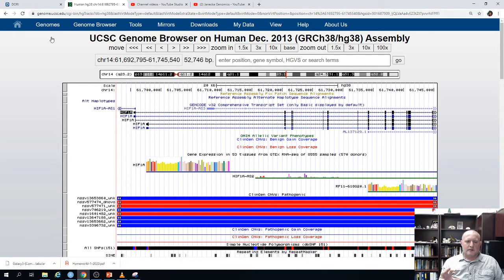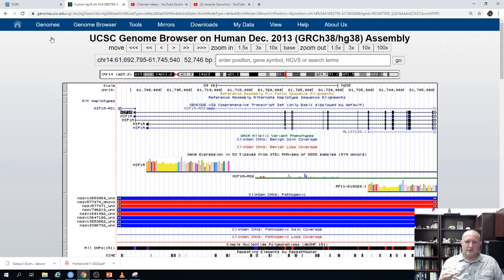The best information mapped onto genomes is really for the human genome and some model organisms like mouse, zebrafish, and drosophila. All these different tracks are publicly available datasets — you can download them, analyze them, and use them in your research. I just posted a video about how you can download data and tracks from UCSC, put it into Galaxy, and then transfer it to RStudio.